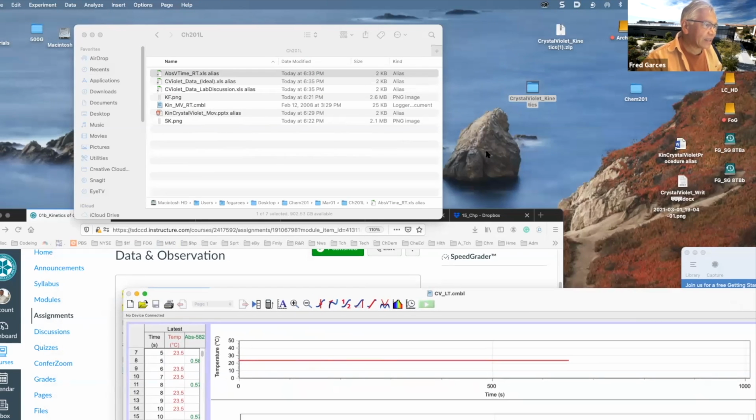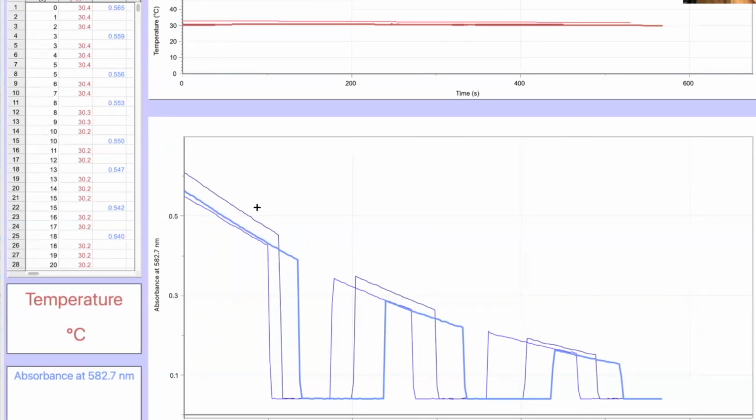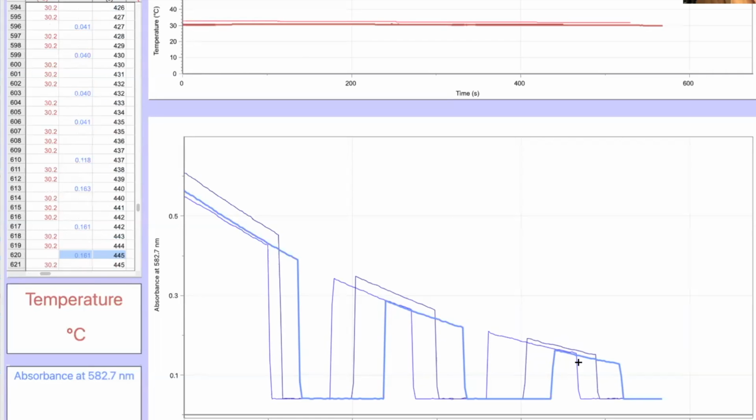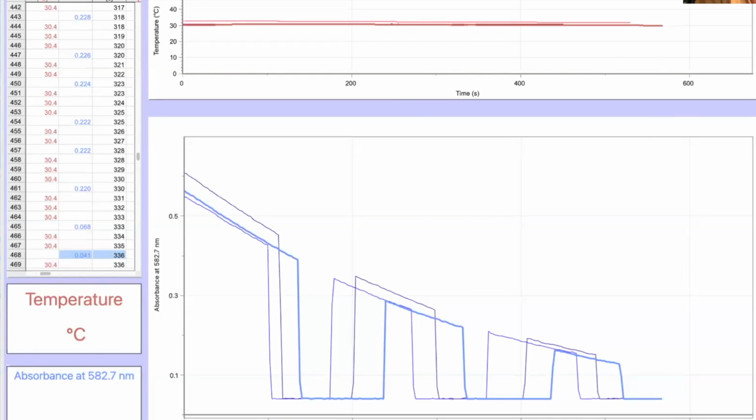And then for the high temperature, let's take a look at that data set as well. Find where they intersect. Yeah, here you've got a better range. From here to here, here to here, and here to here. Okay, that's fine. If you get data sets there and you find 20 good ones, then you don't have to graph everything that you see right here. Just find 20 good data sets, and life will be much easier when you do the analysis.